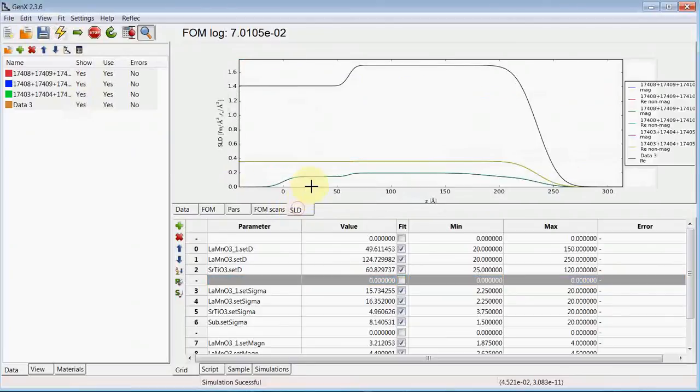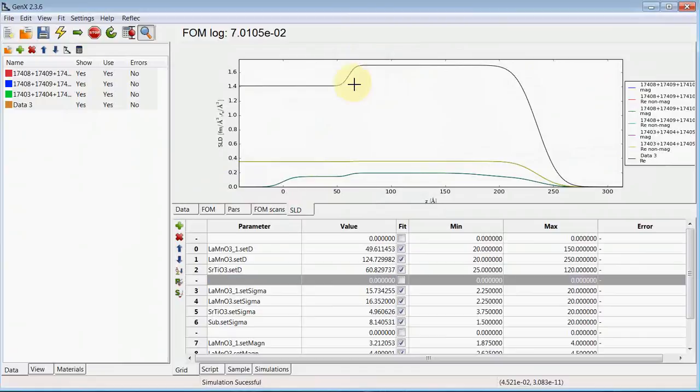Now we see the top layer of LMO is clearly defined by the X-rays and the magnetic layer thickness is clearly defined by the neutrons.